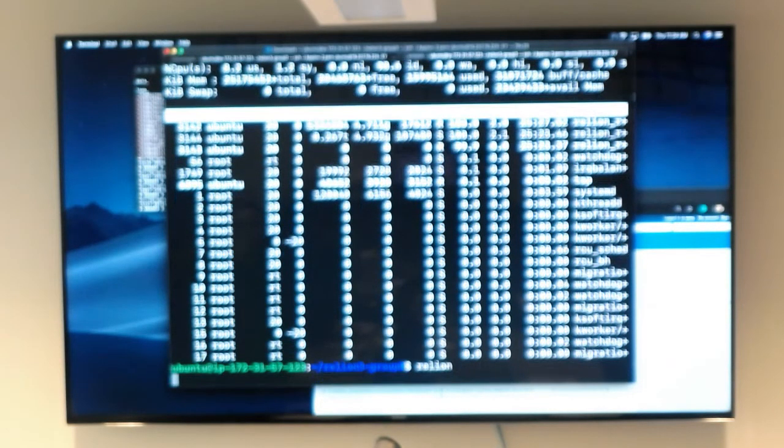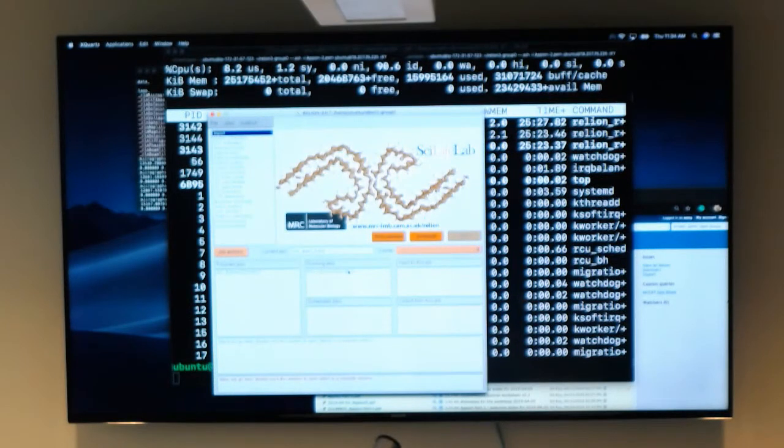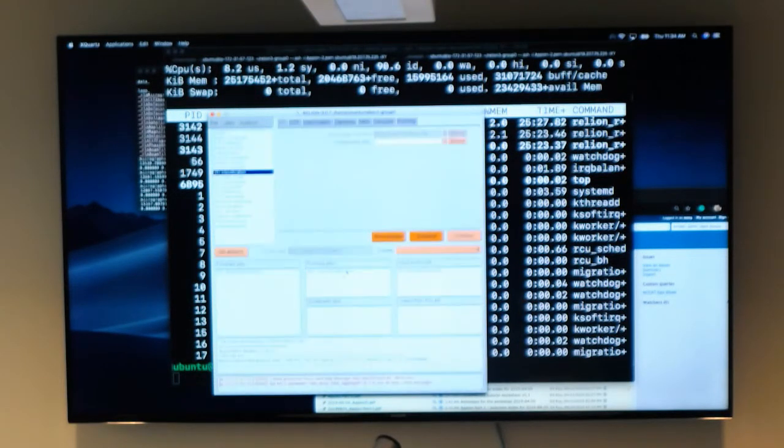And what will end up happening is if I terminate a job early and I select it, it might come up with an error message like, it ended prematurely. But I might say, that's fine. I actually only needed 20 iterations and I was perfectly fine. You could always go in and mark it as finished. Or you can say it's not finished. So it's sort of up to you.